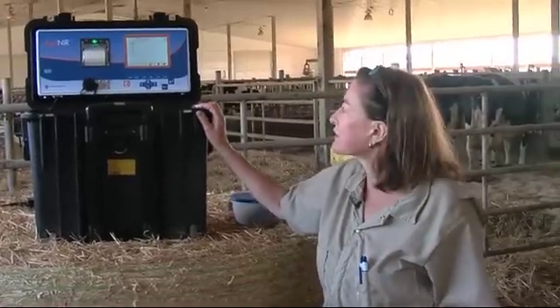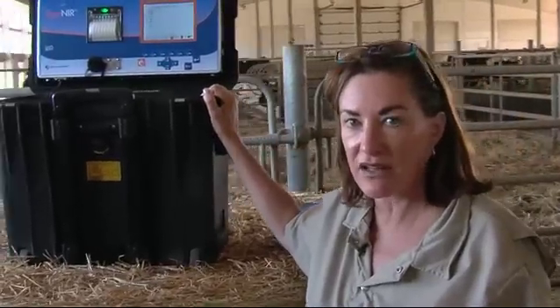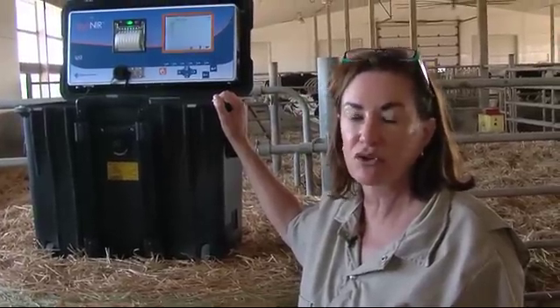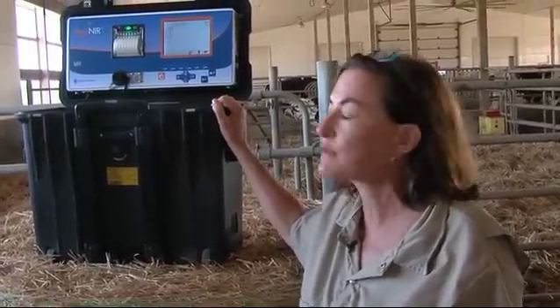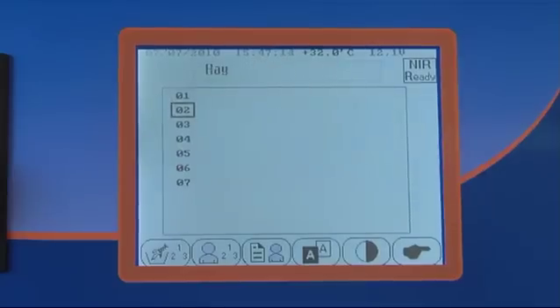Basically, what this piece of equipment does is it does approximate or chemical analysis using NIR technology, similarly to what you would get from your local forage analysis lab. We have the potential to do a corn silage analysis, hay analysis, high moisture corn analysis, alfalfa hay analysis, grass silage analysis, a total TMR analysis, or soybean meal analysis.